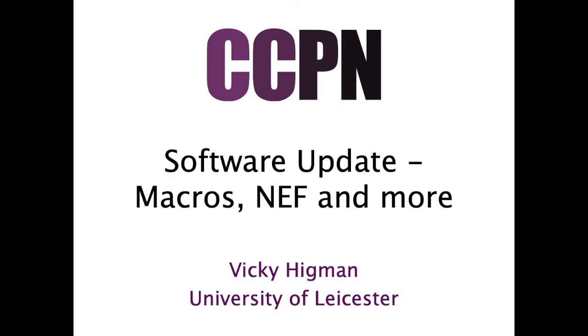But let's get back to the software. So what I did last year was to give you a general introduction to our version 3 software, which is much more modern, flexible and user-friendly than version 2. It does still lack some version 2 features, so if you're wanting to do relaxation analysis or calculate structure, you're probably still better off sticking with version 2 for the time being. But over the next 6 to 12 months, we shall hope to have ported most of our version 2 features to version 3. But for smaller projects, for titrations, assignments, version 3 is really nice. If you want to see that talk from last year, then you can have a look at that on our YouTube channel.